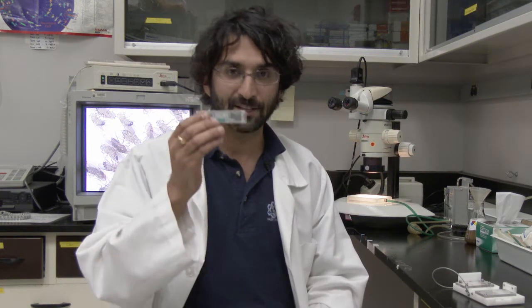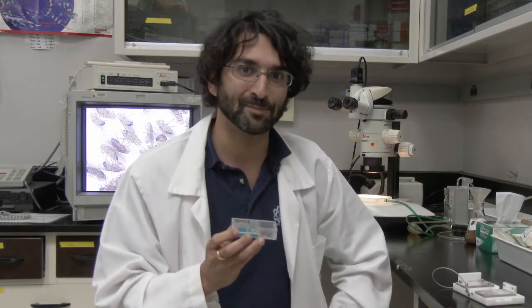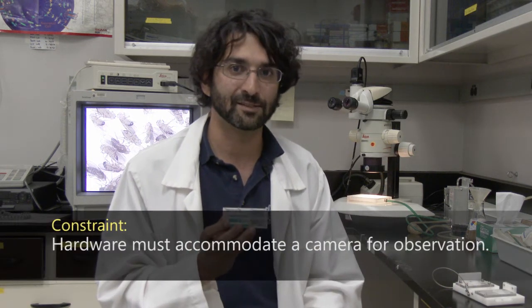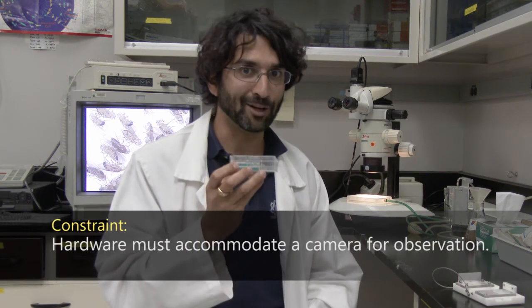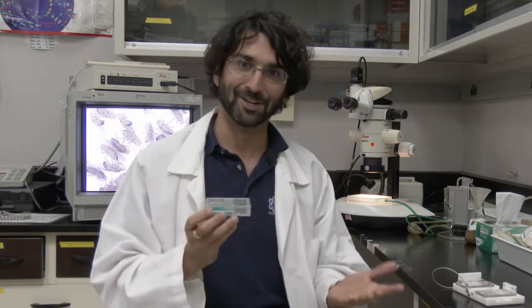So we need to build a unit that houses this same cassette on the International Space Station, satisfying one of the scientific requirements given to us by the team. That is, they want to monitor the behavior of the flies in space. That means we need a camera. And if you put this inside a box with a camera, it's not going to work very well. Why? Because there are no lights.